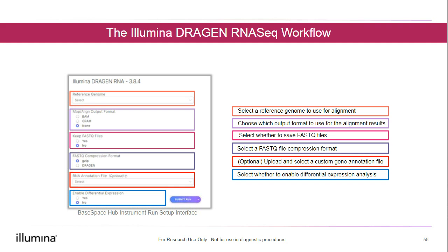If using a preloaded genome, like the human genome or mouse and rat genomes, and a custom file is not uploaded, the annotation file found within the genome folder on the instrument will be used. Users can also find the gene annotation files from sources such as RefGene, Ensembl, UCSC, GENCODE, AceView, and Vega.